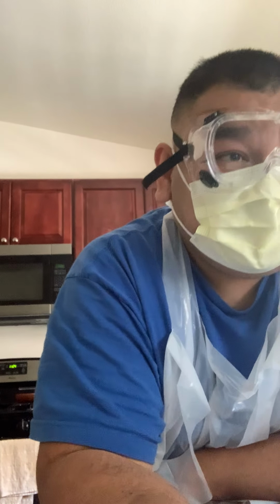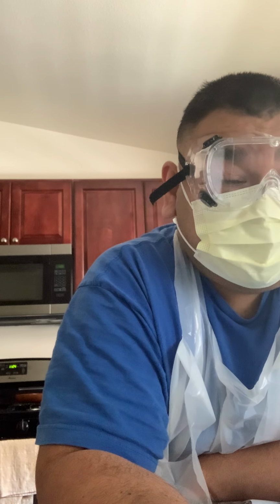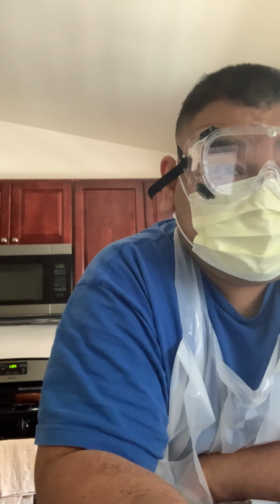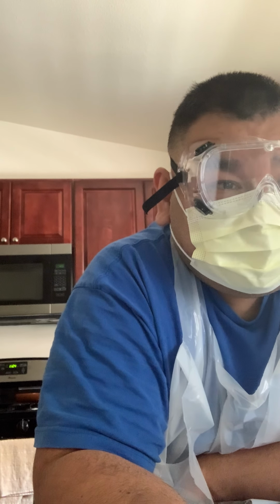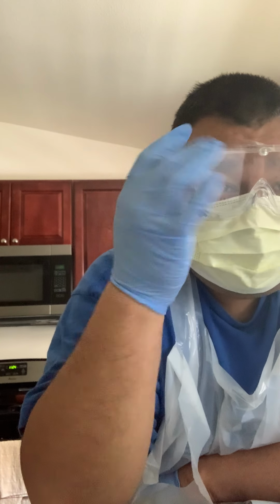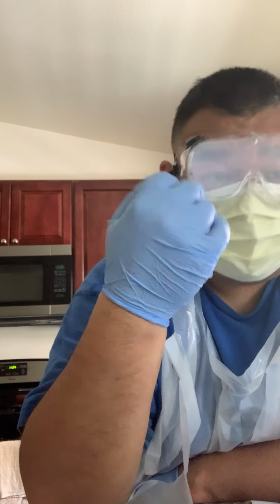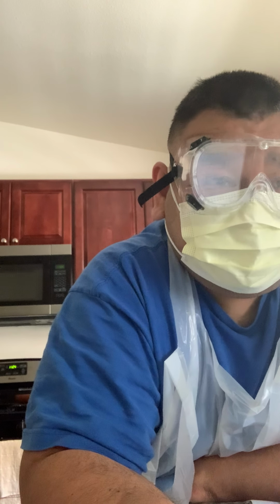For this procedure, I already warmed up the MRVP broth to room temperature for approximately 30 minutes, washed my hands, and put on my safety gloves, mask, apron, and goggles. I disinfect my working surface with 10% bleach solution.